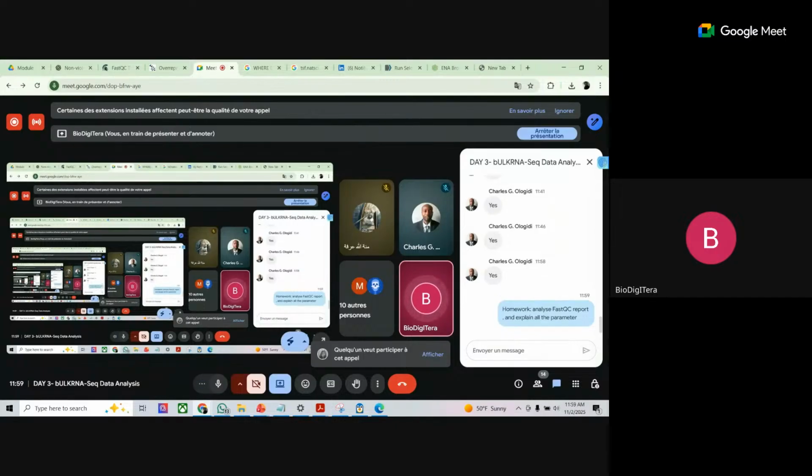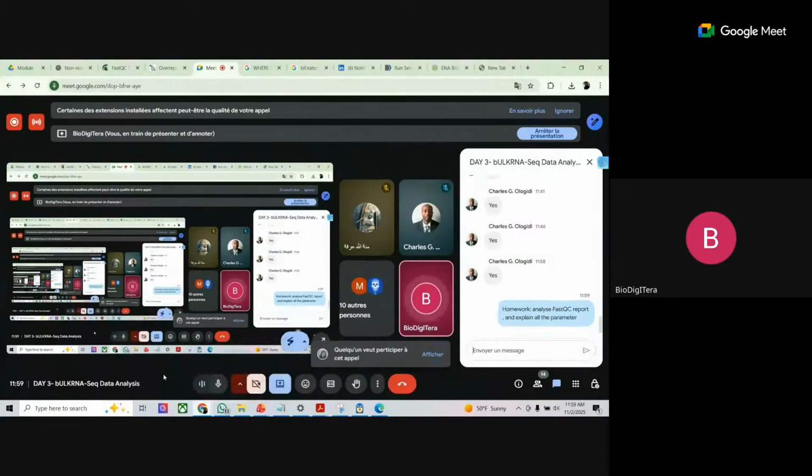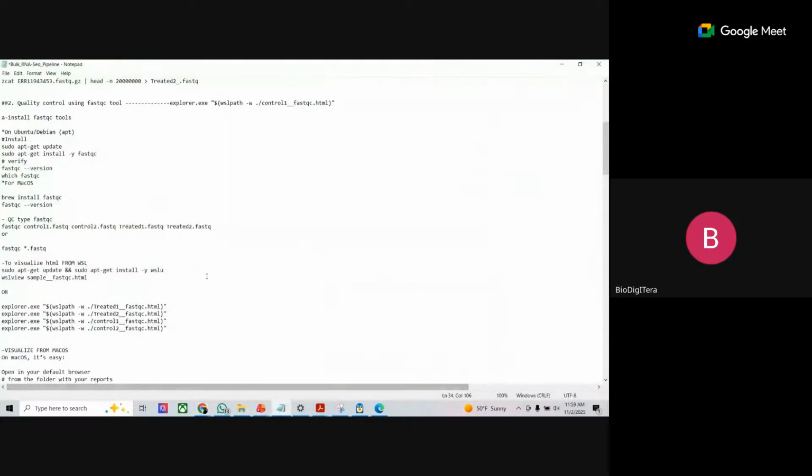You will love it. And this part, when you go for other forms of RNA-Seq, DNA-Seq, if you understand this one, you will understand all other kinds of sequencing. It will not be different. Is it okay? Okay, now let's go for trimming.